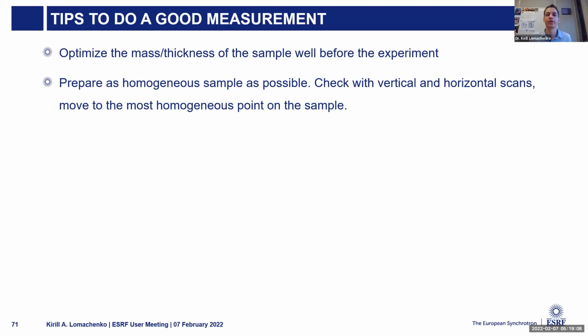It can go completely out of the beam, or at least it can move a little bit, which for capillaries is even more drastic than for pellets, because in the capillaries the sample is intrinsically inhomogeneous. First of all, because the cross-section is round, it's circular, and because it's a loose powder. So in a capillary, it's loose powder, so there are holes, there are voids anyway.